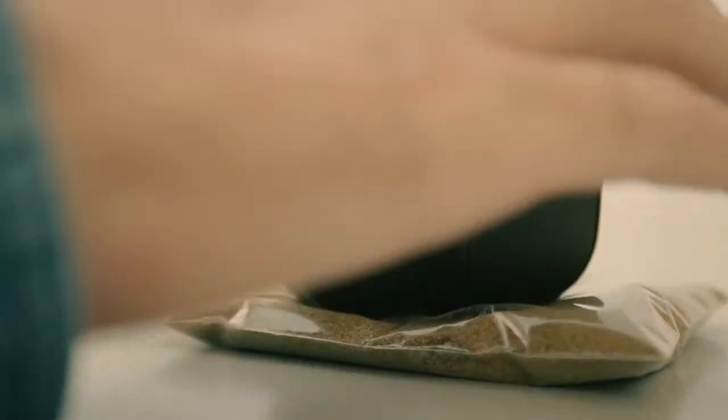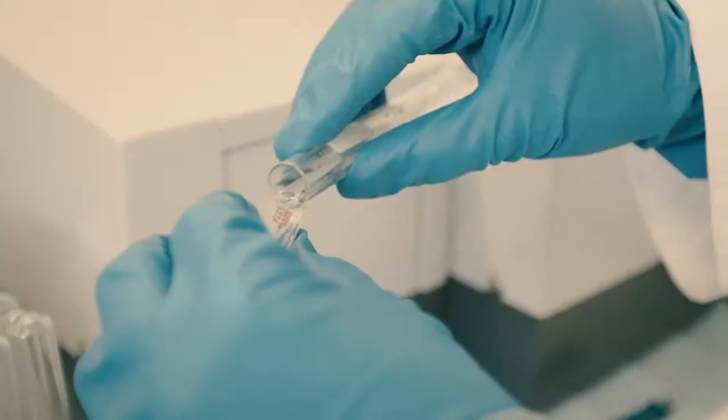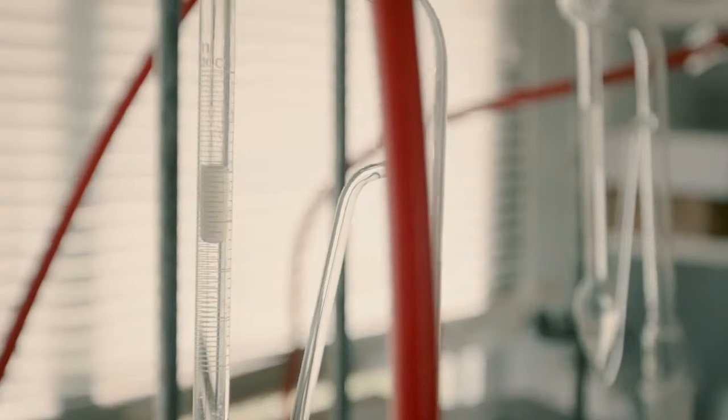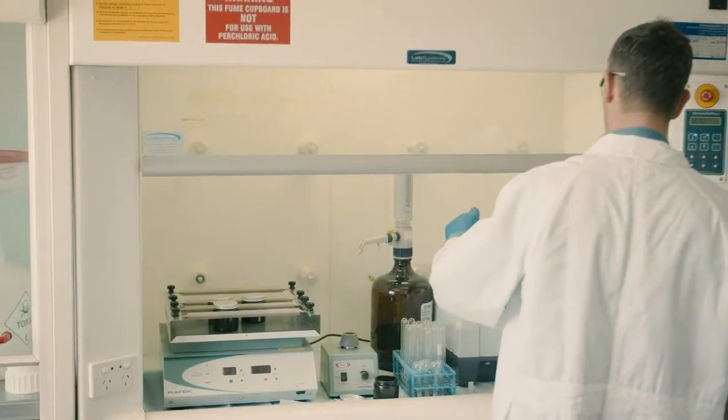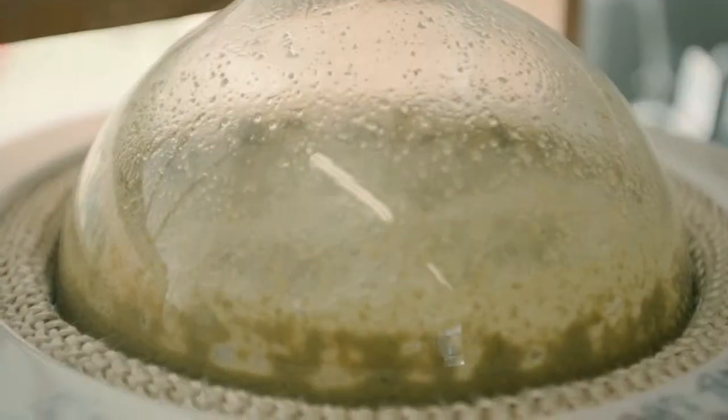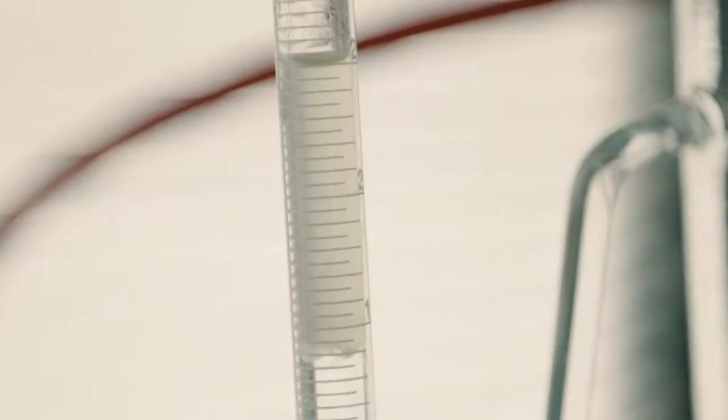Now we use near-infrared spectroscopy, which is much safer and more efficient. We've been running NIR in parallel with the ultraviolet spectrophotometer, distillation and moisture analysis to continuously improve the accuracy of our model. The UV spectroanalysis gives us our alpha and beta acid values as well as our hop storage index, and the distillation apparatus gives us our oil content.